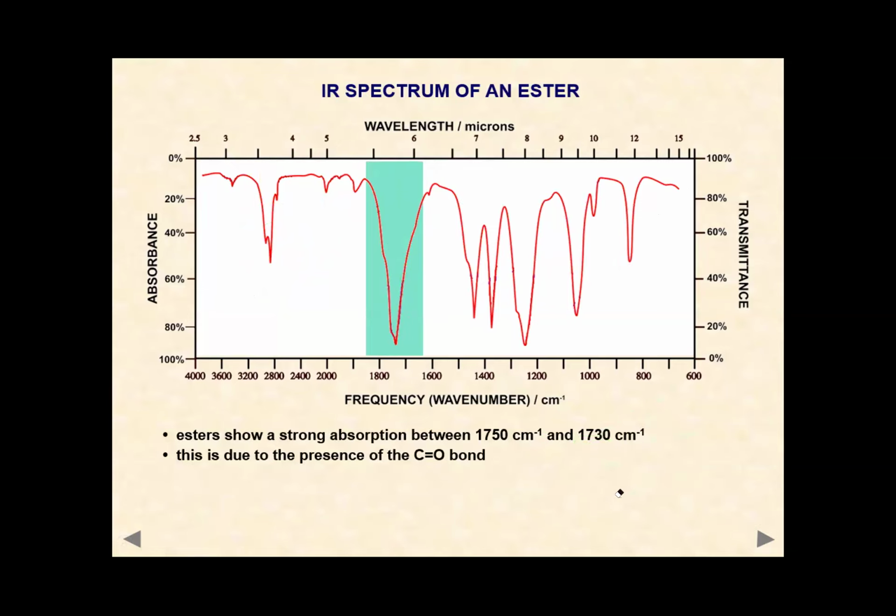So now, infrared spectrum of an ester. Now, just look at it and then think about it. Why is this showing a peak here? I'll give you 10 seconds to think about it, and then we will discuss.